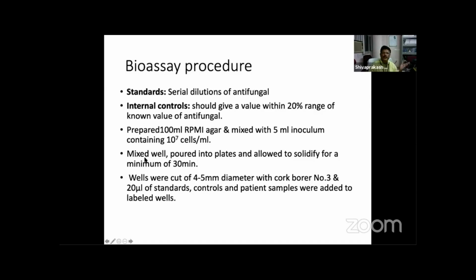Then what you have to do is mix well, pour into the plates and allow the medium to solidify for 30 minutes. You then have to cut wells. You should have a template to cut the wells. Otherwise, you can use the back of a Pasteur pipette or something with small tubes, so that you can add the samples.